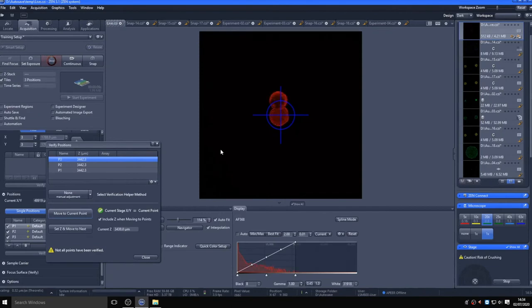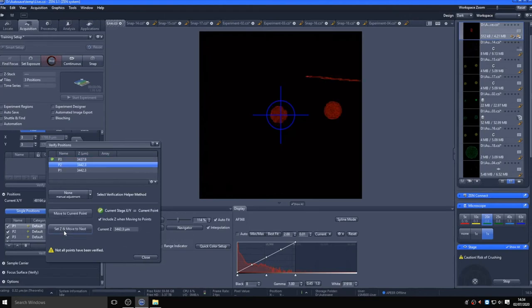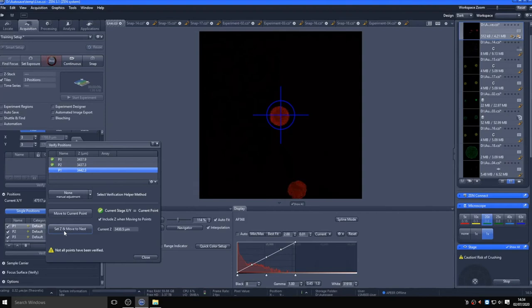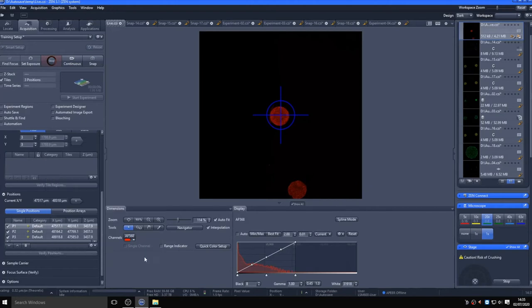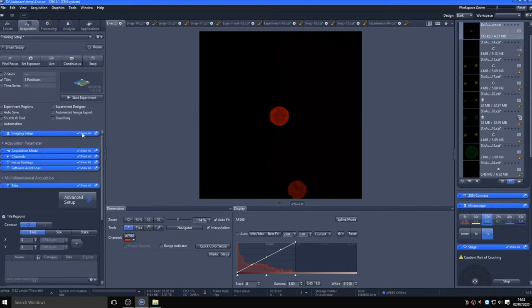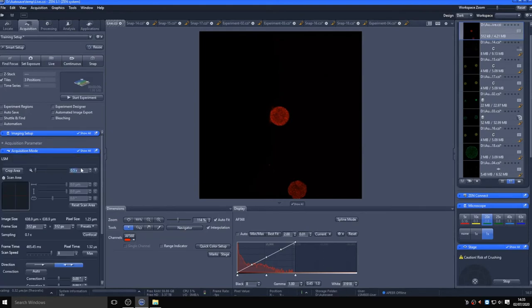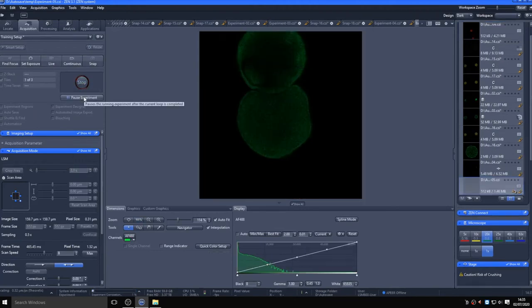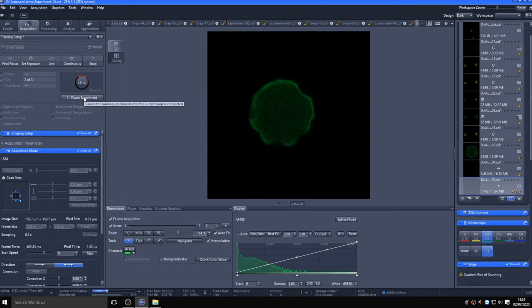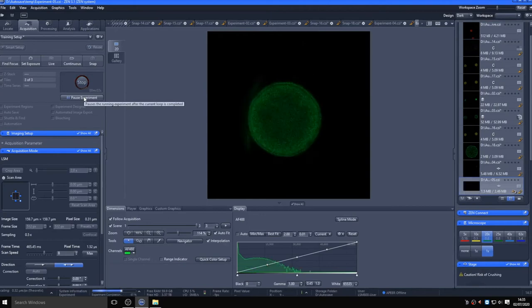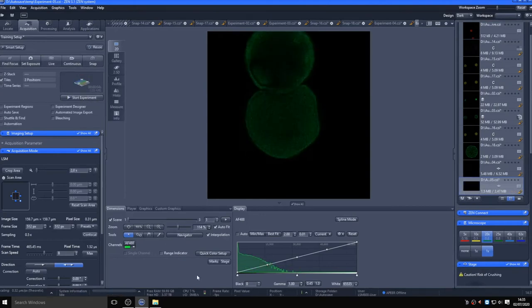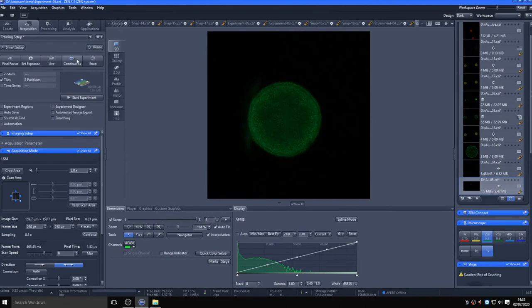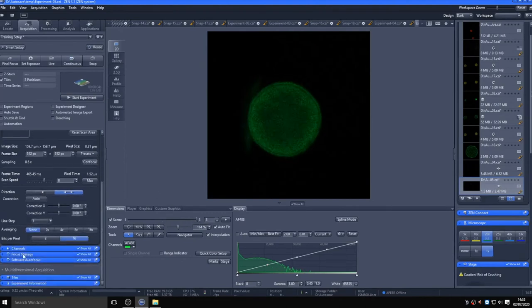Going back to a two-times zoom so we are only imaging the cropped region and starting the experiment, you can see the system goes between each of the set positions in all three axes and takes the images. You can scroll through the images using the scenes slider. The CZI file format will store the three images in one file.